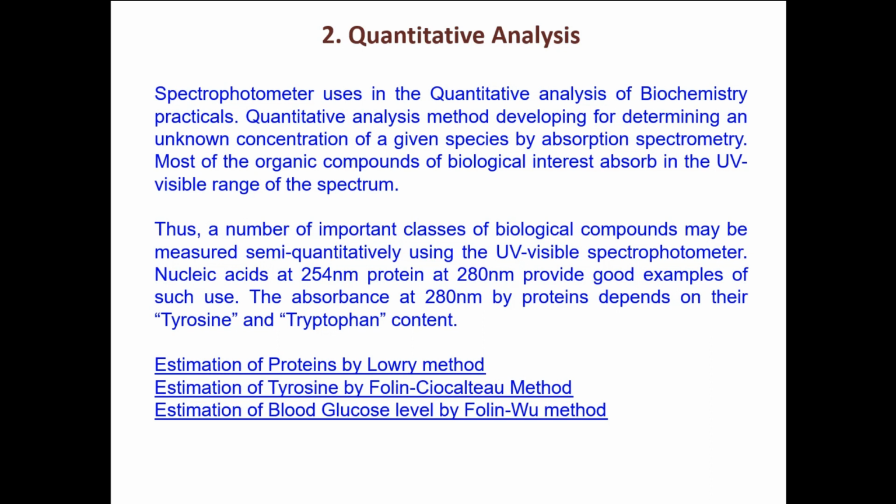say for example, I'll give you an example here. So for example, in the examination you have been given a question: isolate and quantify the DNA from E. coli. So what will you do?